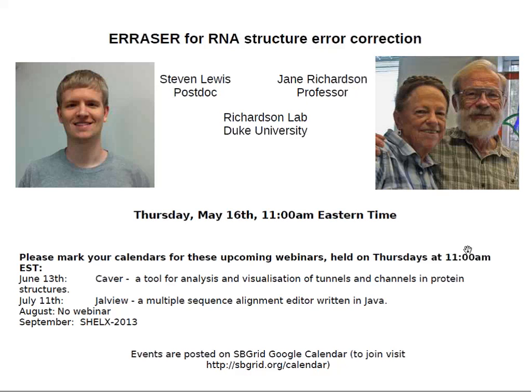Yeah, well, it certainly lets you get a reasonable structure at a worse resolution than you might have managed before. It really needs an input structure, and so at the moment it doesn't help you with initial fitting. A lot of people are trying to work on that part of the problem, and we are at Phoenix among others. So eventually that'll probably be automated as well, but it isn't yet.